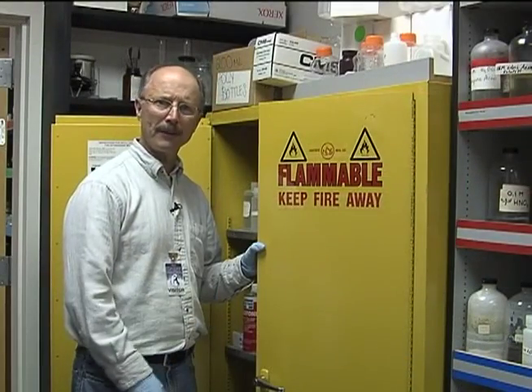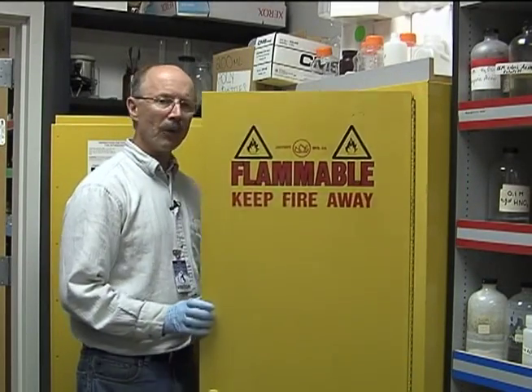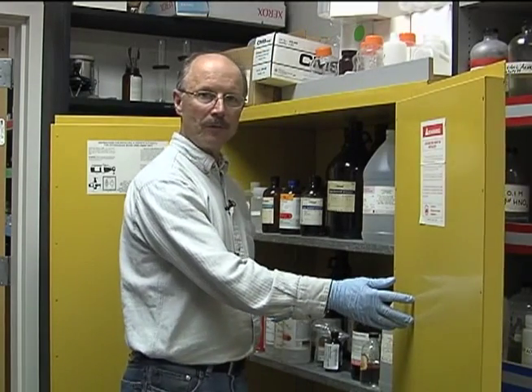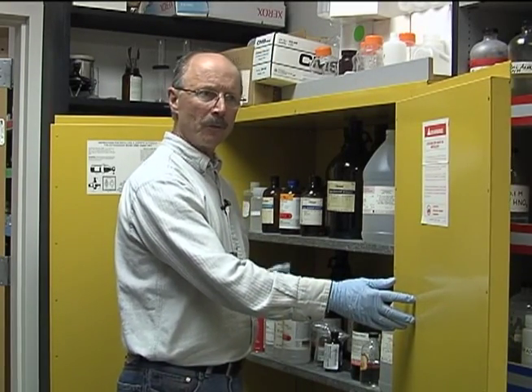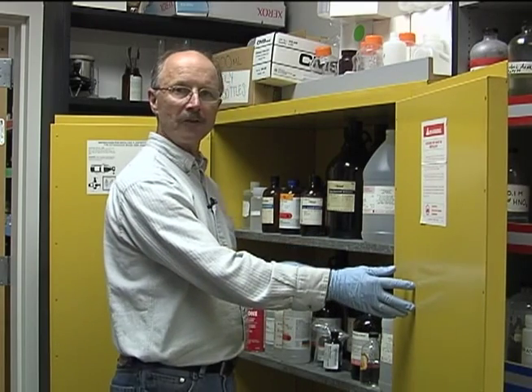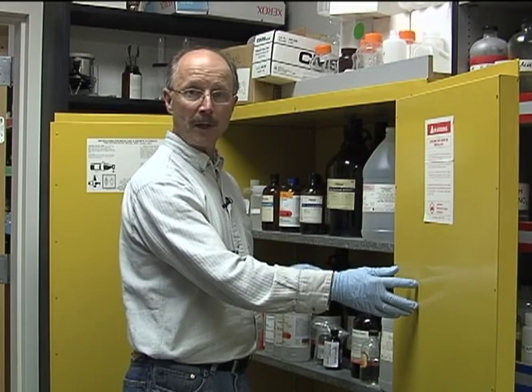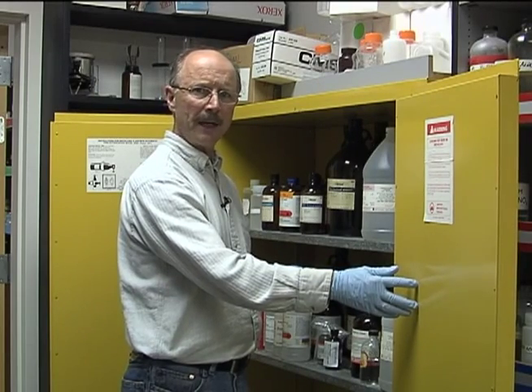And in this section we'll be talking about high hazard chemicals. Quite often where we'll find them is in a flammable cabinet just like this one, which you find in many of the schools. What we're going to be looking for is whether we'll find something in here that could potentially explode just by mishandling it, and how to identify those compounds, what some of them are, and why you would possibly even have them in your school.